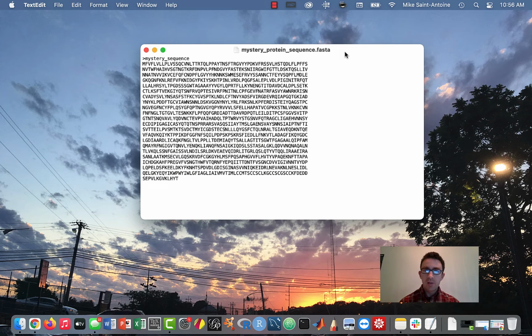So this video is going to be a little bit different than videos I've made in the past. This is going to be my first video on the topic of bioinformatics sequence analysis. In my own research in grad school, I don't really do much of this kind of sequence analysis research, but I think it still is important to know how to do if you're working in the bioinformatics field.